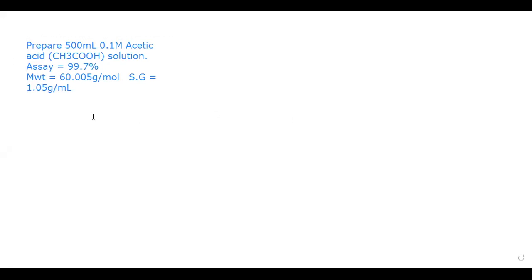The first thing, I know the mass of the acetic acid, CH3COOH, in 1,000 mL should produce 1 molar CH3COOH.